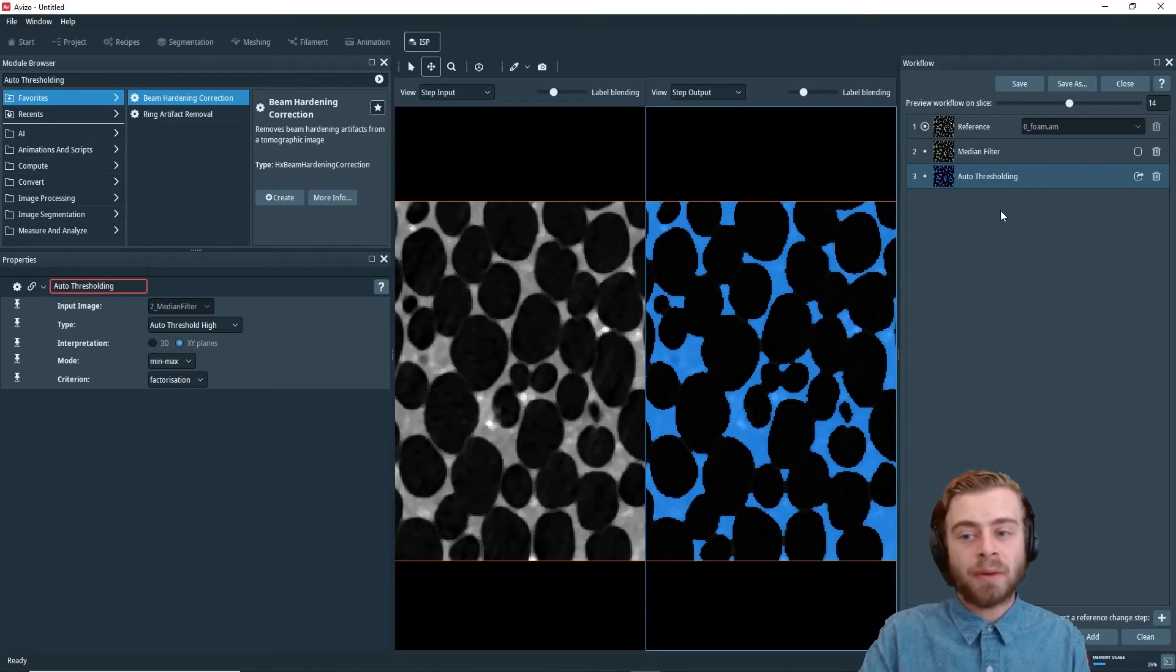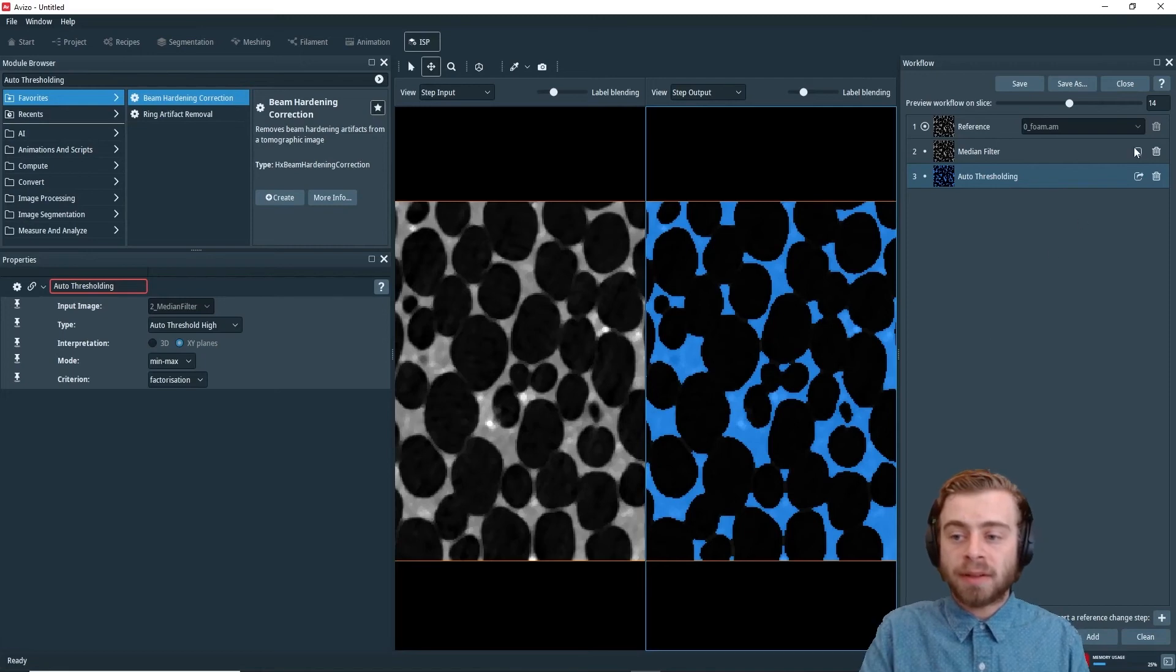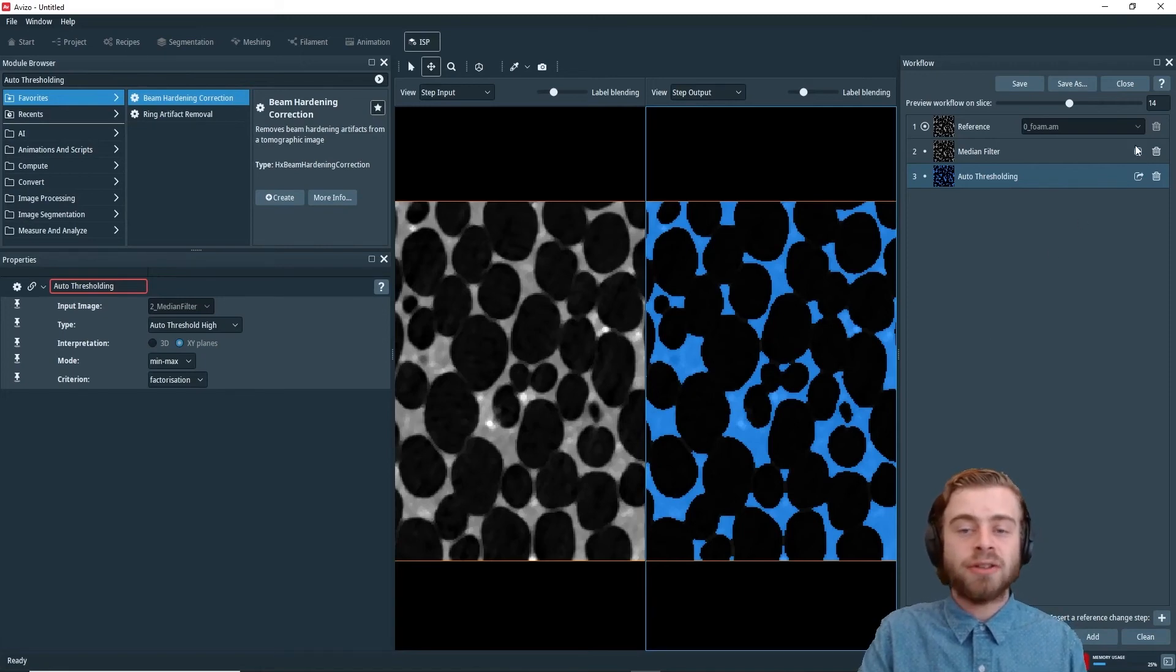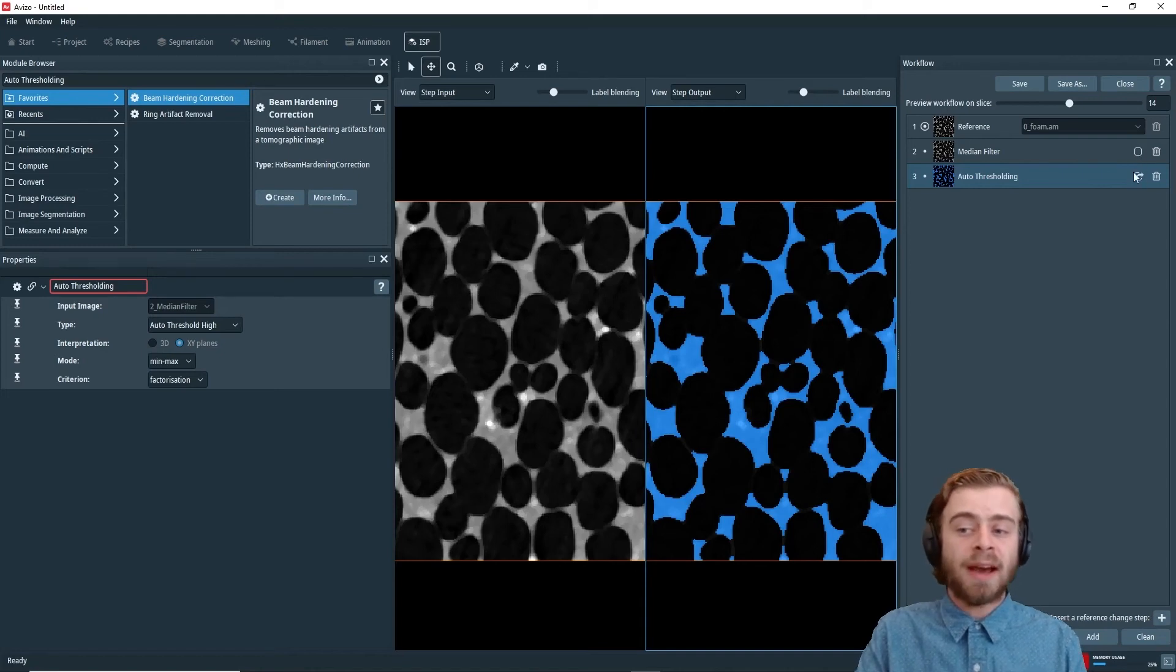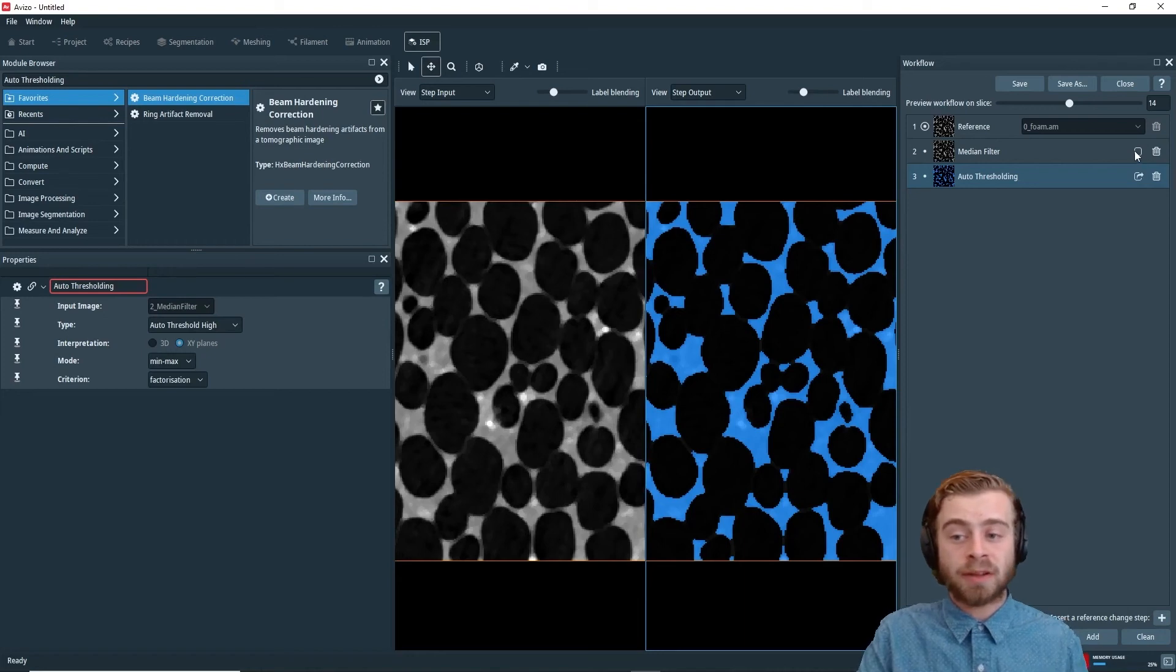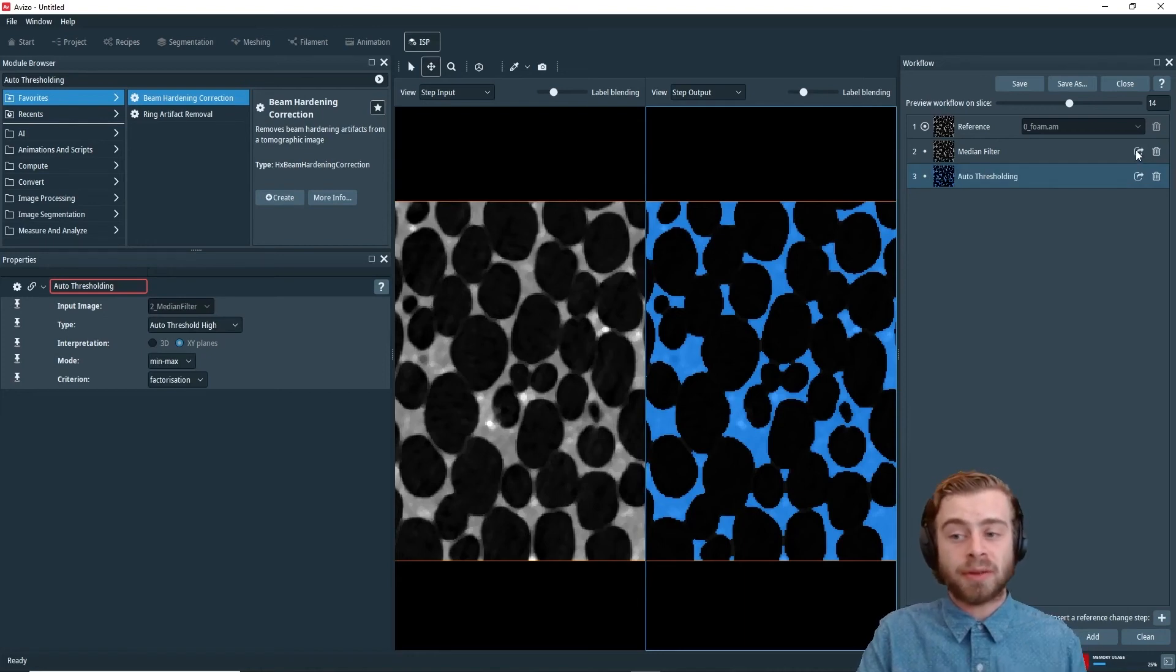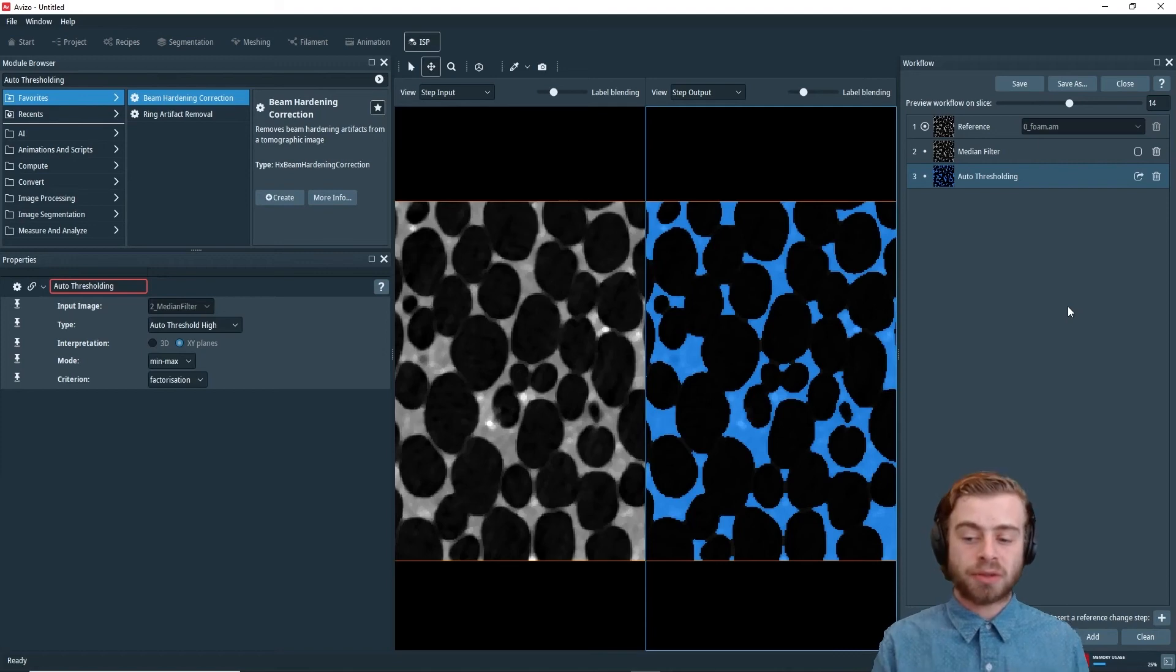The last thing I want to go over is what is exported from the workflow. So this box right here, you can click it on or off, and it allows you to choose what steps you want to export from the workflow. So right now, we only export the last step. But if we wanted to export the median filter step too, we could do that by just clicking here. But for our purposes, we're just going to leave it as is.